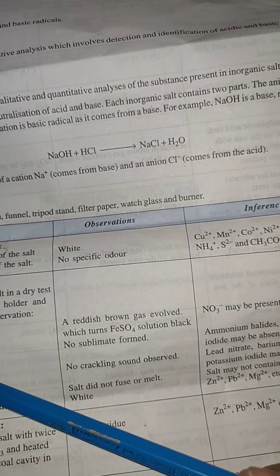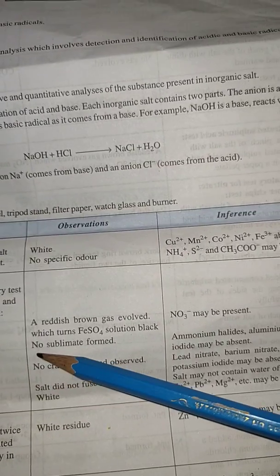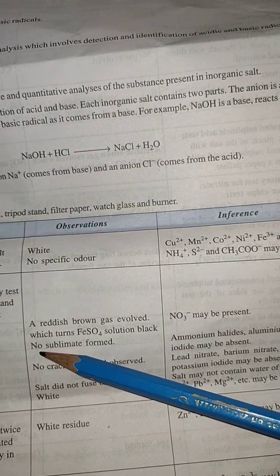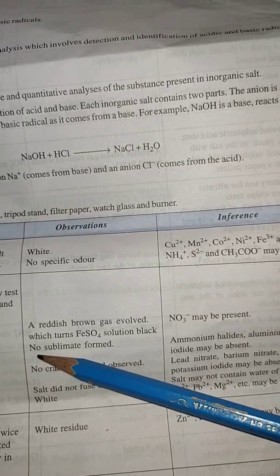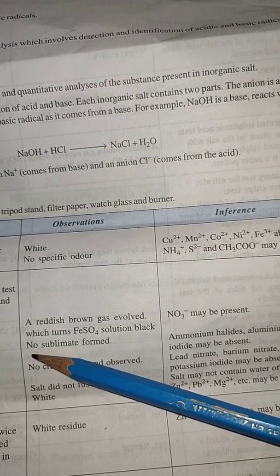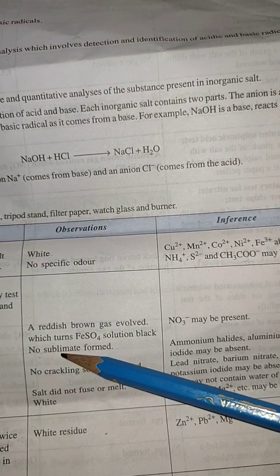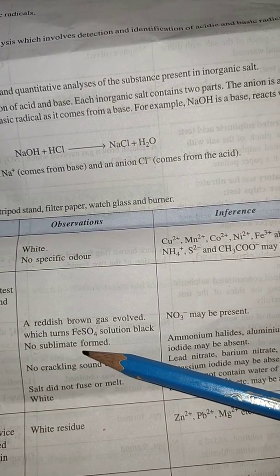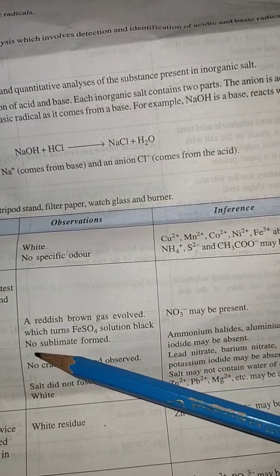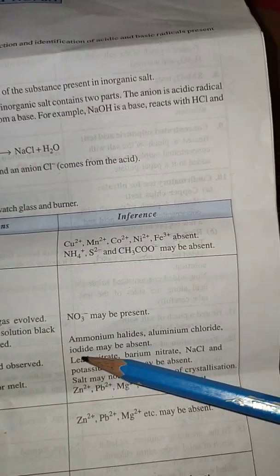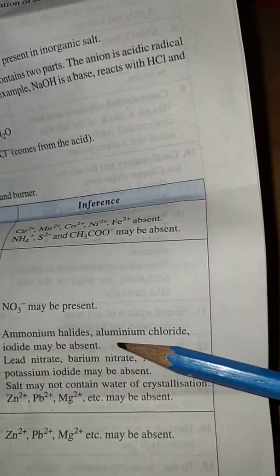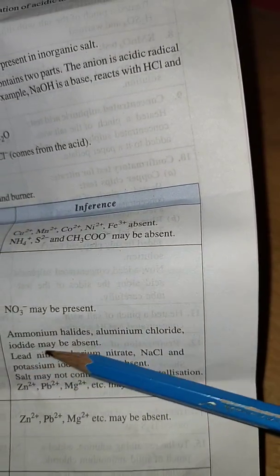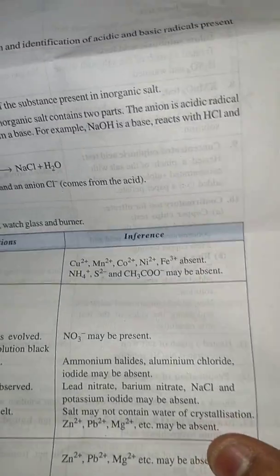The next part is sublimation. If you dry heat it, you will just heat it directly and the sublimation is when solid converts into vapors or gases form without converting into liquid. So no sublimate formed in the given salt, so ammonium halides, ammonium chloride, iodide may be absent.